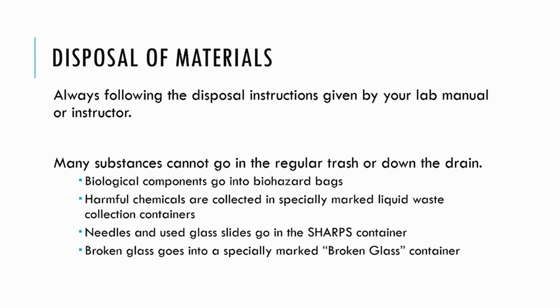Proper disposal is also very important. And again, follow the instructions of your instructor or your lab protocol when it comes to proper disposal. There are a lot of substances that cannot go in the regular trash can or down the drain. Many things that we deal with in our day-to-day life can just be thrown into the garbage or poured down a drain, and that's fine. And in the lab, sometimes that will be the case. Paper towels can go in the garbage, water can go down the drain, and that's fine.